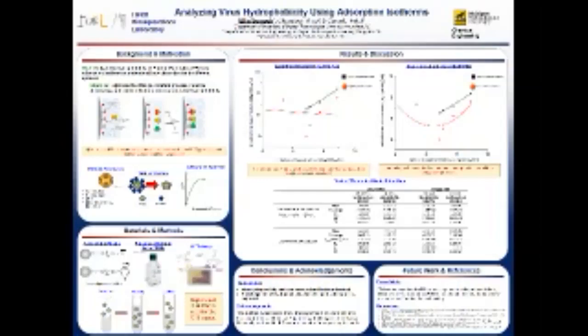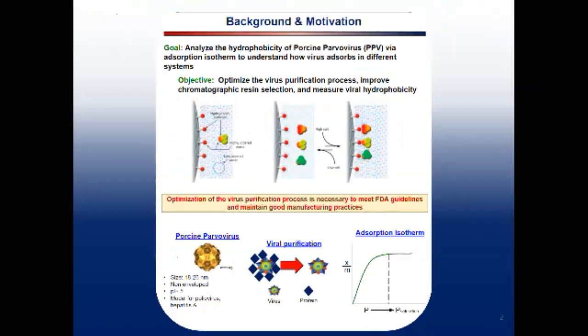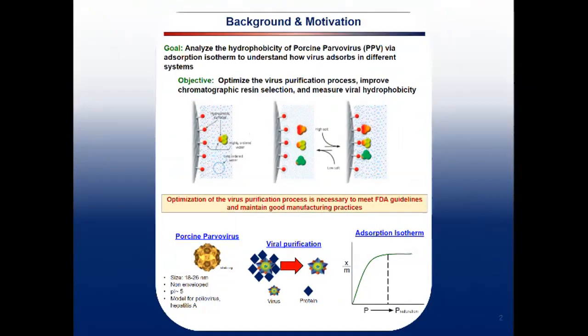I am a second-year biochemistry and molecular biology student working in Dr. Karen Helt's bioseparations laboratory. The project discussed today is the analysis of the hydrophobicity of viruses using adsorption isotherms. The goal of the project is to analyze the hydrophobicity of porcine parvovirus, or PPV, to optimize the virus purification process, improve chromatographic resin selection, and measure the virus's hydrophobicity.